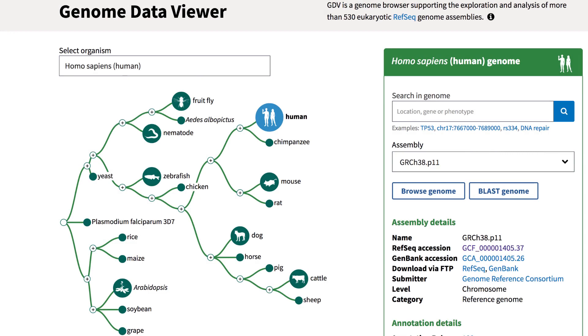Give the Genome Data Viewer a try the next time you run BLAST against assembled genomes.